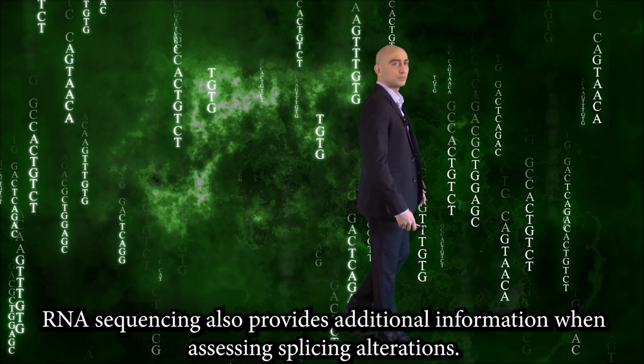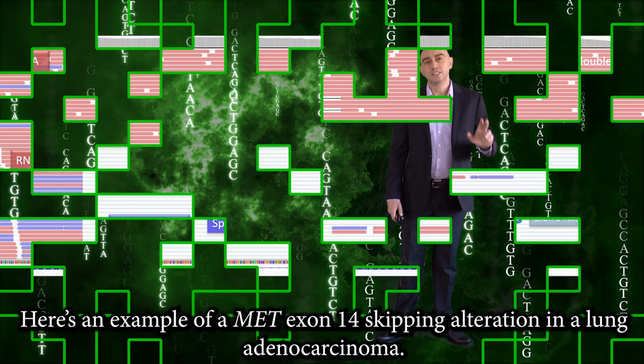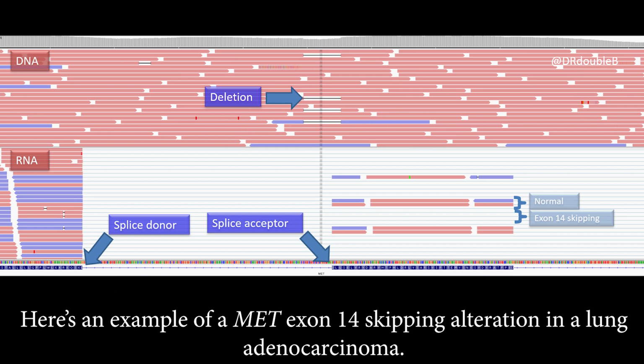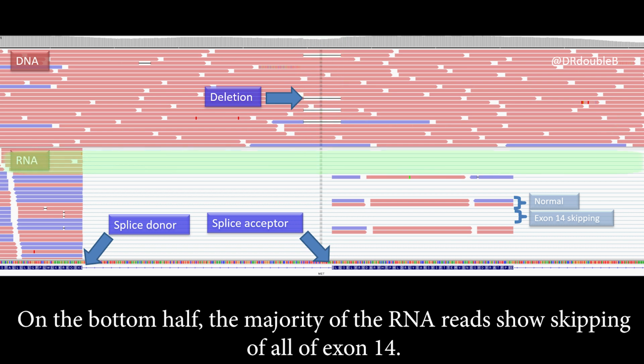RNA sequencing also provides additional information when assessing splicing alterations. Here's an example of a MET exon 14 skipping alteration in a lung adenocarcinoma. The top half, which is DNA, shows a deletion of the splice acceptor site. On the bottom half, the majority of the RNA reads show skipping of all of the exon 14.